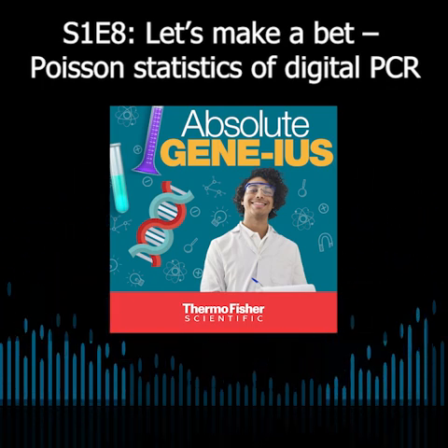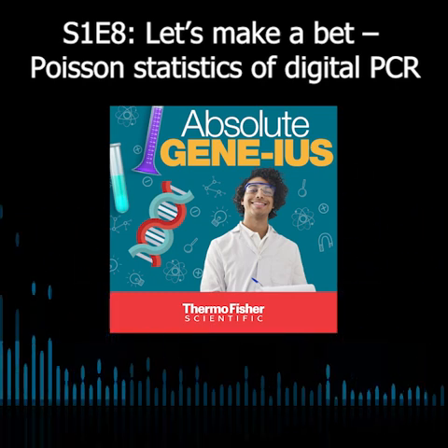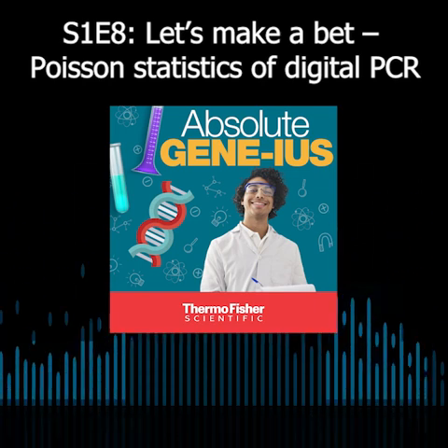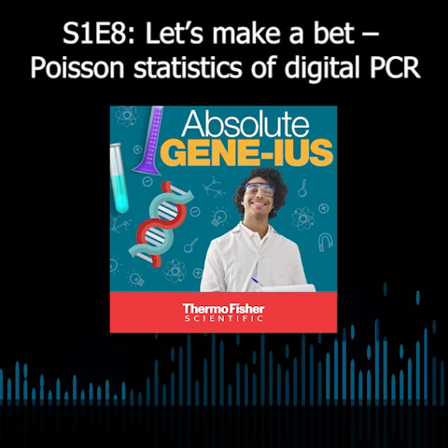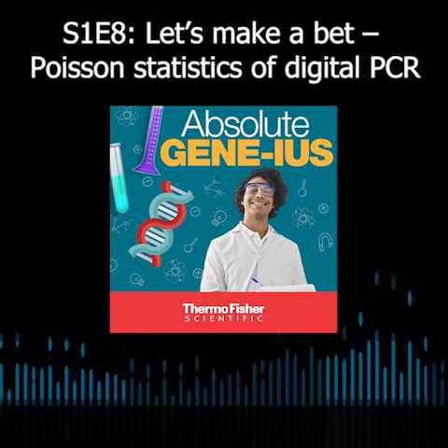However, with digital PCR, because it's binary, do we have signal or not? I don't care if you were seeing an amp curve in your individual mini reaction, you might see it super sluggishly growing, really poor efficiency. That's fine, as long as by the end of cycling, it gets above the cloud of the background noise. That's still counted as a positive either way. And so that gives you a lot of robustness against inhibitors.